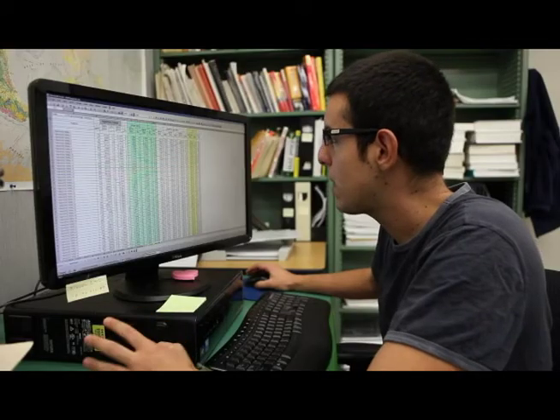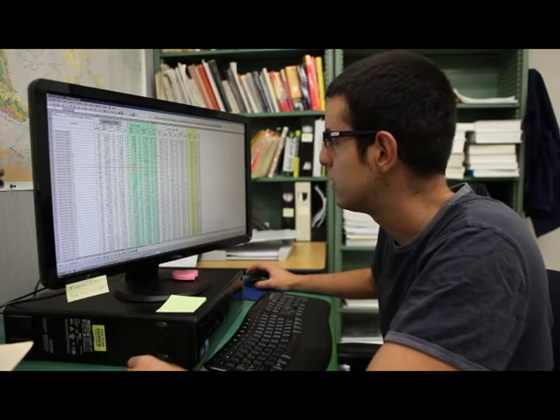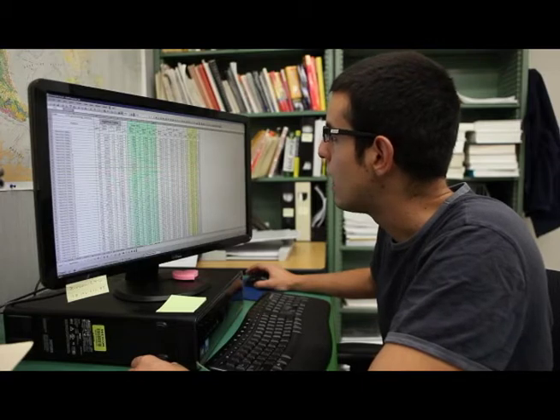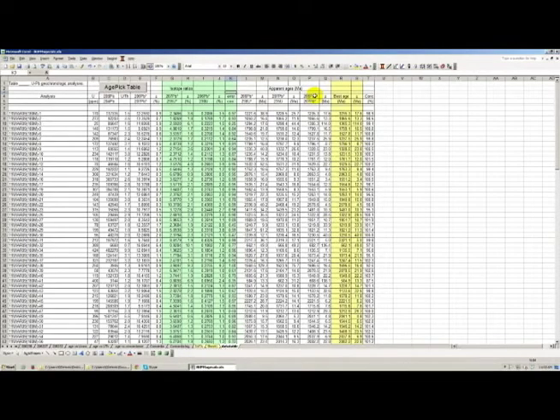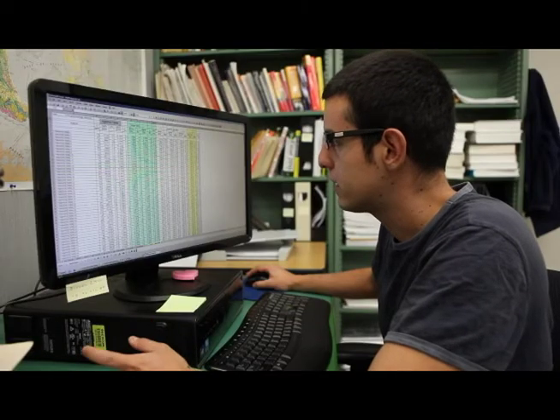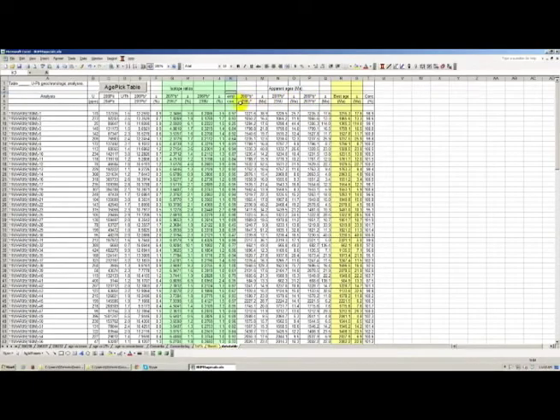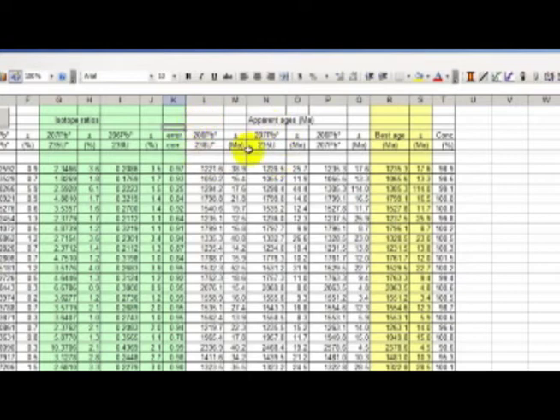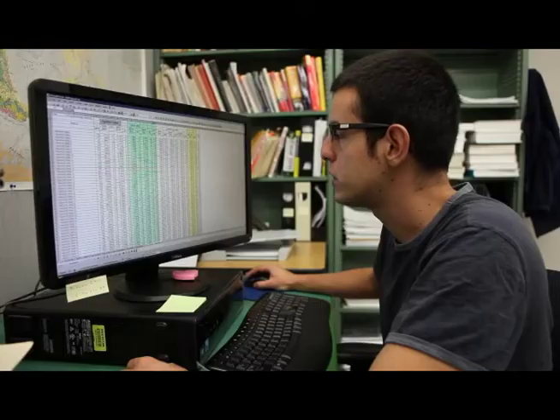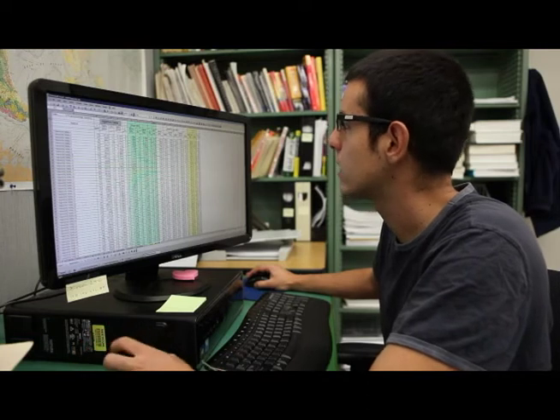But if you're way back in the Precambrian, anything older than 1.4 Ga, so anything in the Meso- and Paleoproterozoic and things like that, the most precise ratio that you can measure is the 206/207 ratio. In addition, if a grain has been affected by modern lead loss, that is going to significantly affect the 206/238 and 207/235 ratios, but it's not going to strongly affect the 206/207 ratio. So it's not only the most precise, but the most accurate approximation of the real age of that grain.